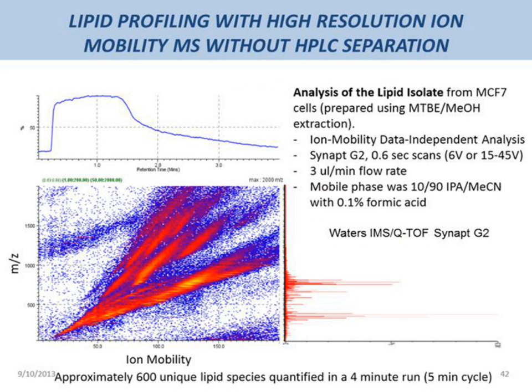With the introduction of ion mobility mass spectrometry that separates ions by their shape rather than mass, we gain a new dimension, high-resolution separations of lipids that can rapidly distinguish between species with identical molecular weight. This example from Dr. Arthur Mosley's lab at the Duke University Proteomics Core nicely illustrates the multidimensional ion mobility separation of complex lipid profile extracted from tissue culture samples.